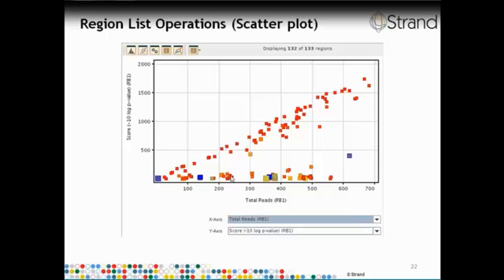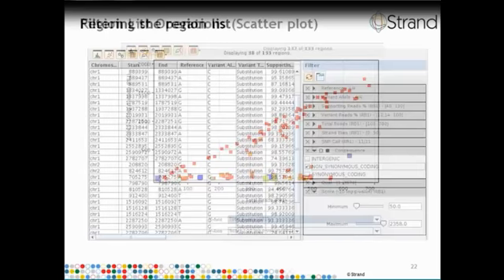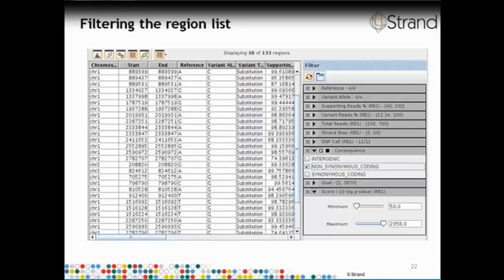So we can see at a single glance that there are 264 reads which have an A instead of a T, a C instead of a G, a C instead of a T, and so on. And this indicates that there are correlated SNPs here, and the SNPs have very high confidence. In this manner, by starting with a SNP list, we can find out the effect of the SNPs.